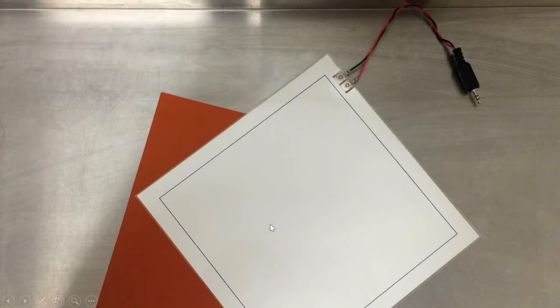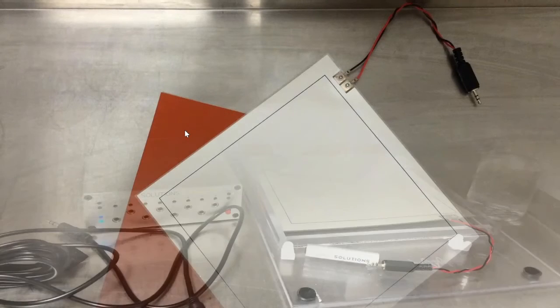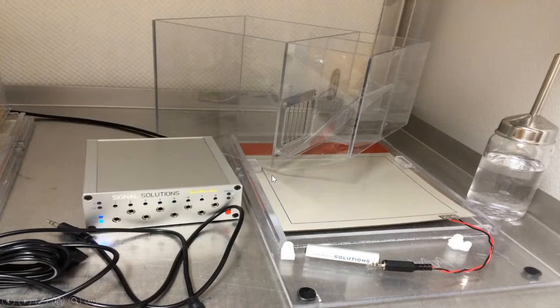We then place this piezo film on top of a rubber pad, and then we slide that into our platform. And then we have a cage that's bottomless that sits right on top of this. We then have another cage shield, we call it, that allows you to put bedding on this. But again, even this raw piezo film is well protected. The outputs from the piezo film, again, piezoelectric, piezo for pressure.